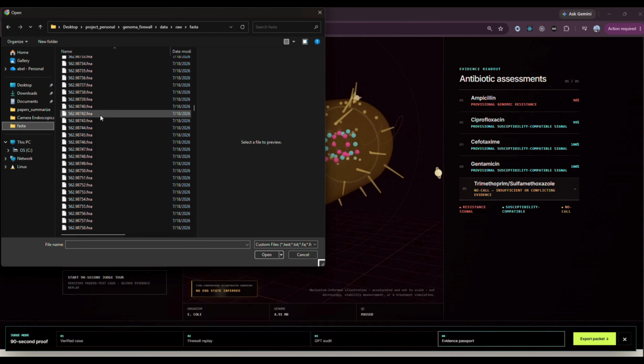A classifier can sound certain when a sample is incomplete, unfamiliar, or poorly supported. Calibrated probabilities are challenged by conformal uncertainty, model agreement, and genetic out-of-distribution distance. Missing model, annotation, target, calibration, or quality evidence produces a machine-readable no-call. Marker absence is never proof of susceptibility.